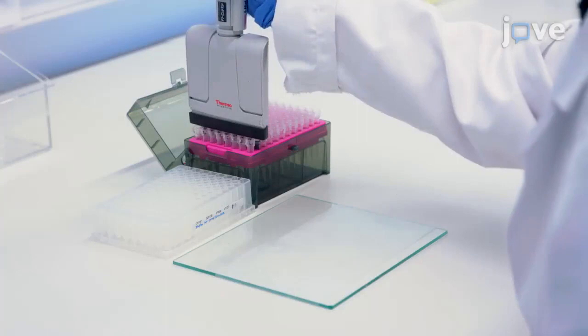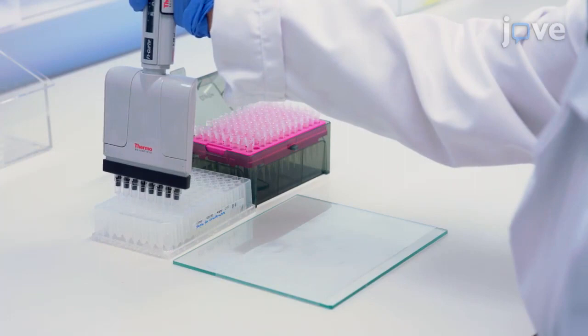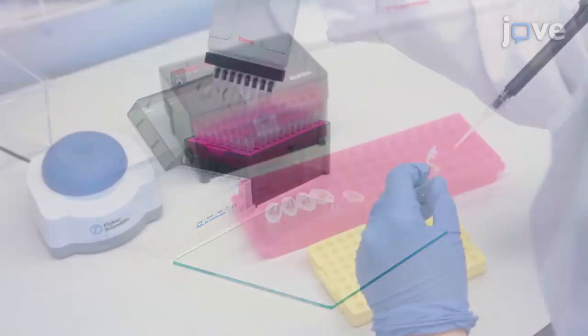Prepare a working stock of staple strands, including strands with handles and locks, by mixing equal amounts of concentration-normalized staple oligonucleotides. Then prepare the origami mixture as detailed in the text protocol. Anneal the mixture in a thermocycler from 80 degrees to 20 degrees Celsius.